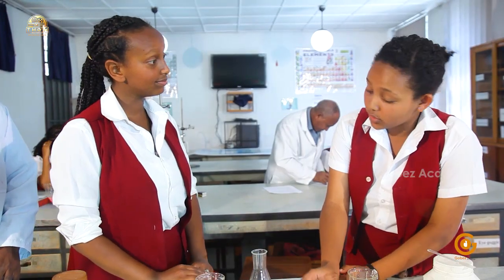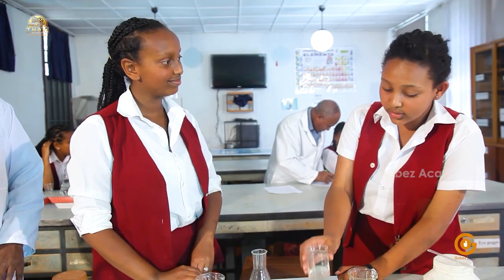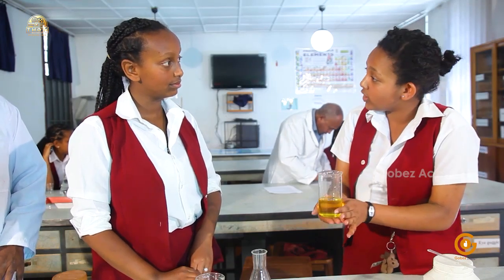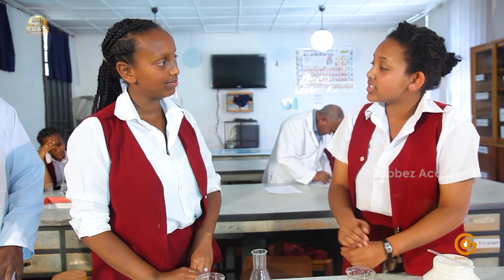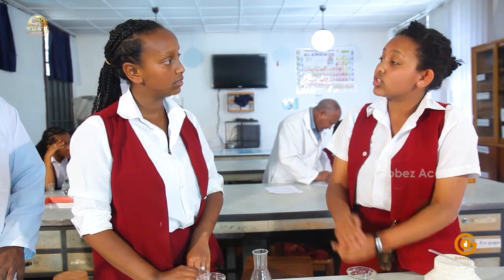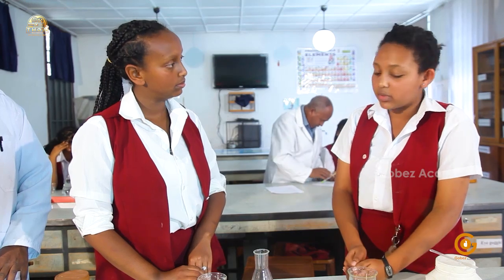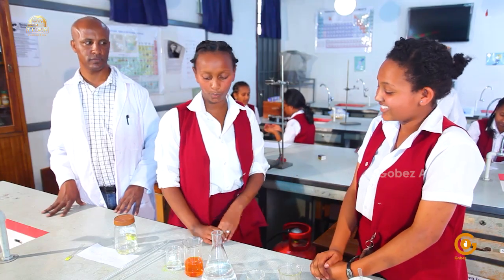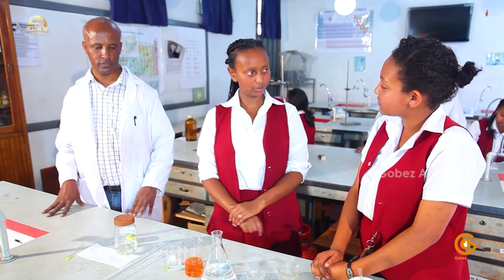Upon the addition of sodium hydroxide base, which was dilute, the dichromate changed its color from orange to yellow. This confirms the presence of a chemical reaction between the two species. The dichromate was changed to chromate. This was also confirmed by the color change, which was from orange to yellow. Okay, so we have proven that using our chemicals.